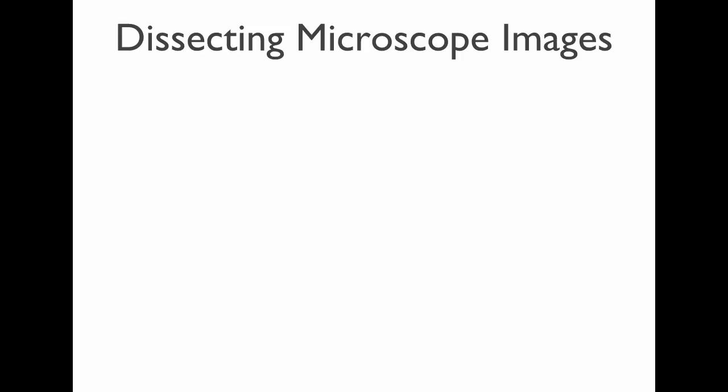So anyway, I talk about all of this because this microscope has two eyepieces. It allows us to get a much better three-dimensional view. We can see the depth of what we're looking at. Okay? Two forward-facing eyes give us great depth perception. We've evolved to have excellent depth perception.